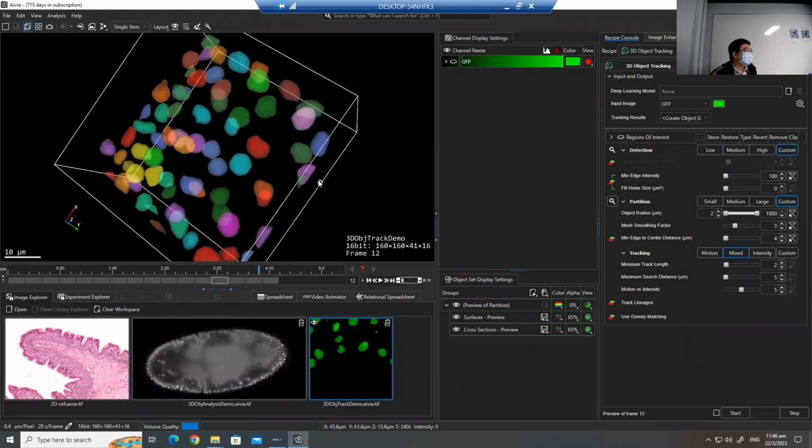Just to make this easier: for time point 1, the object 1 is here. If you set the max search distance at 5 micron, but that object travels like 20 micron in a single time point, that will be counted as 2 separate objects instead of 1. So there is no track line between these 2 objects. This is the search window, but you can set it longer.